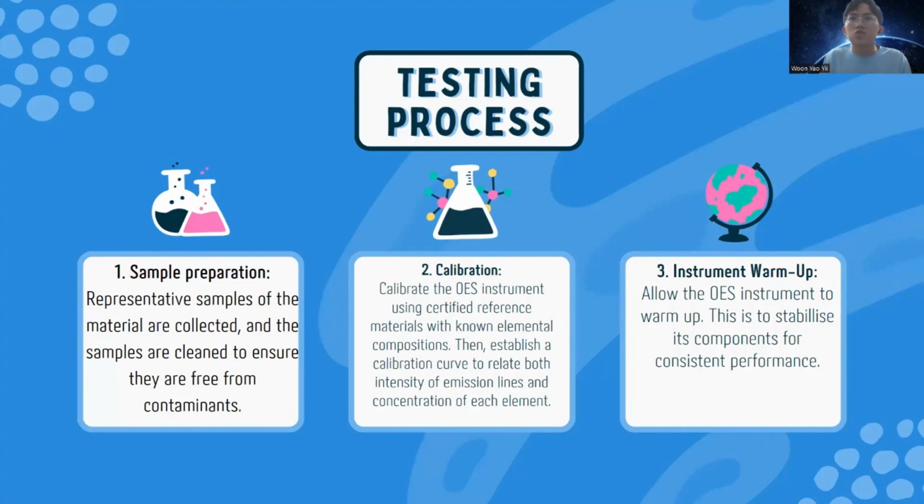The third step is the instrument warm-up. The OES instrument is allowed to warm up so that it can stabilize its components for consistent performance.